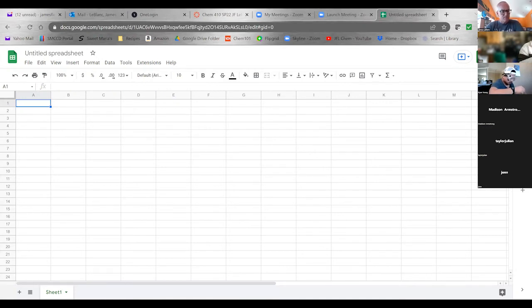At 25%, I got the filter paper standing upright at 1 minute and 30 seconds, and it slowly started to float up top, vertically.